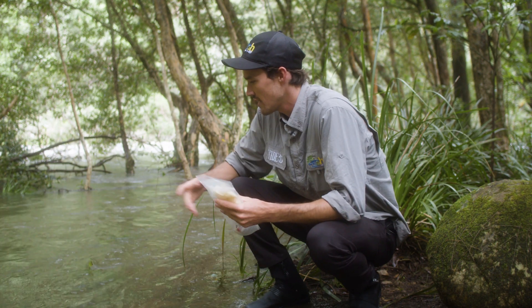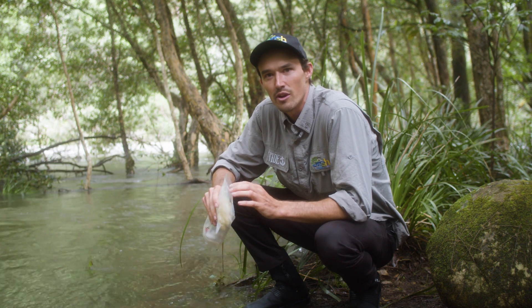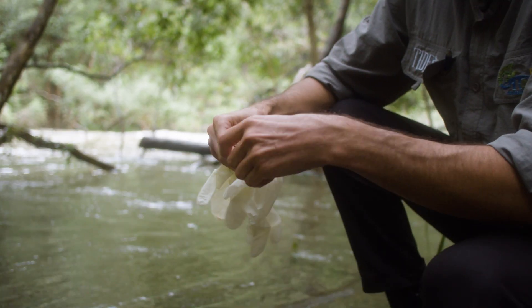Once you've found yourself a nice safe spot to access some flowing water, the first thing we can do is just open up our bag and put our gloves on — that way we won't contaminate anything in the sample kit from then on.